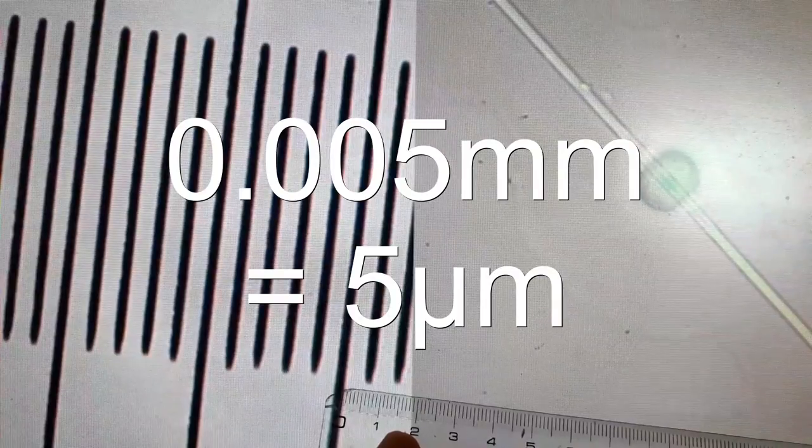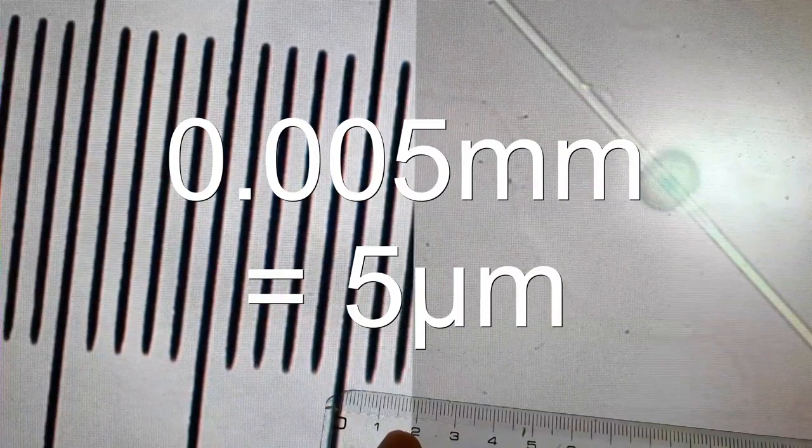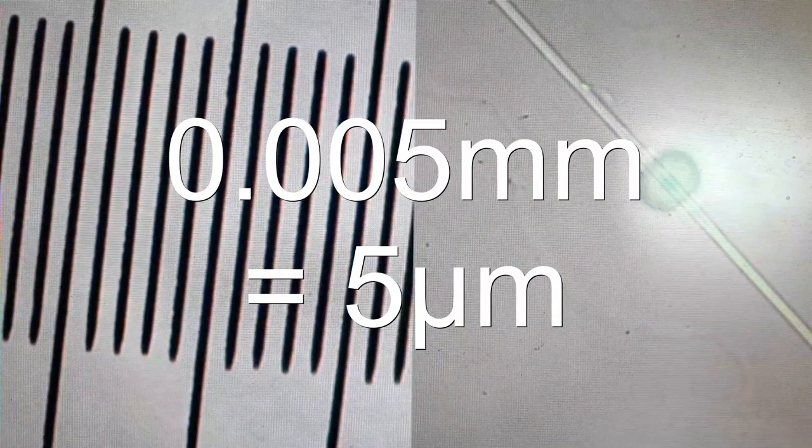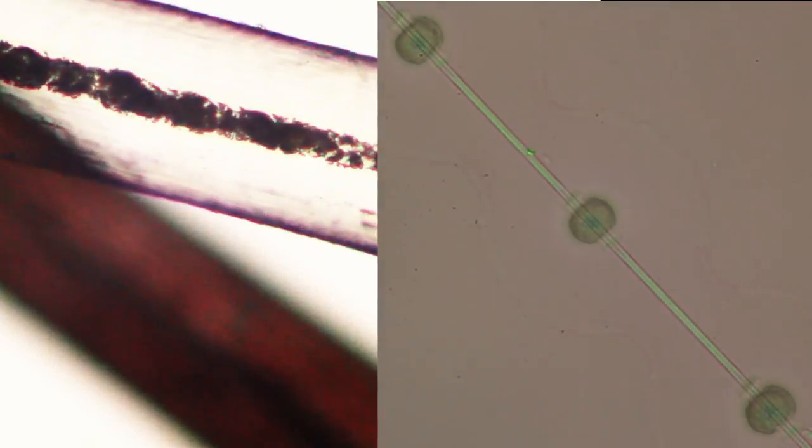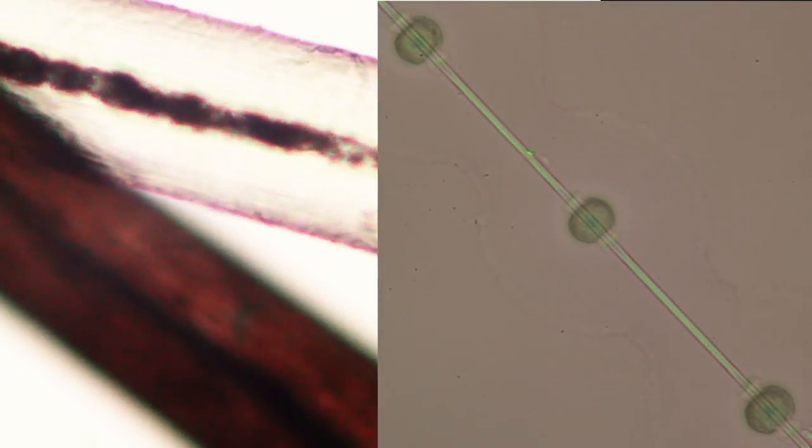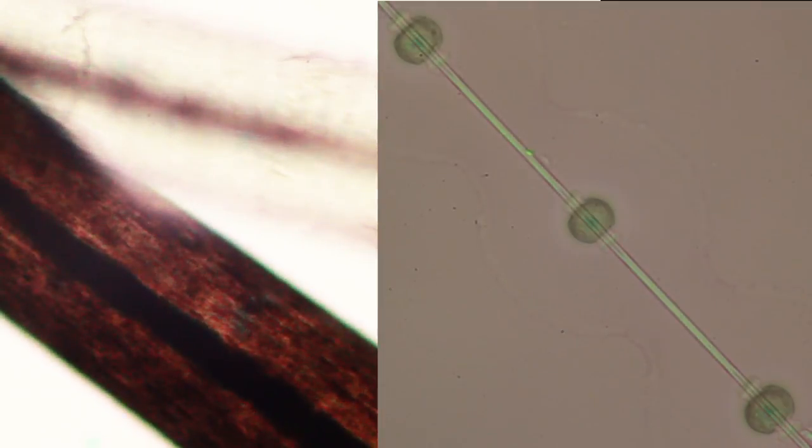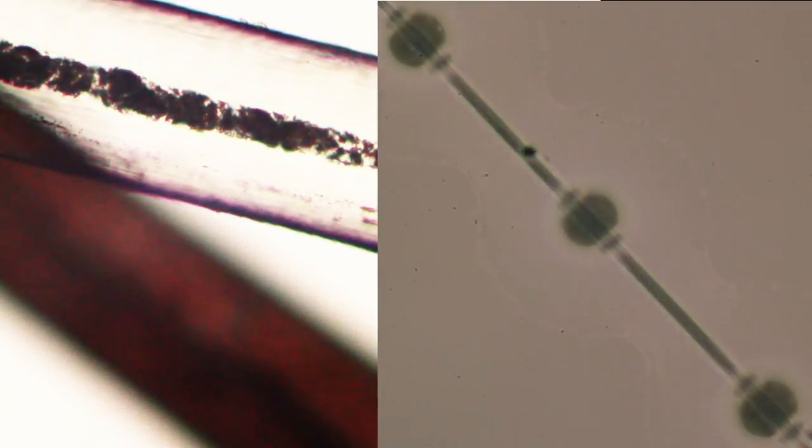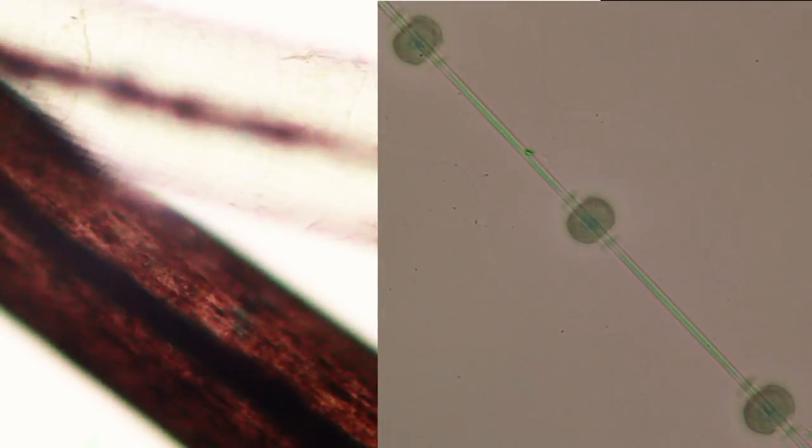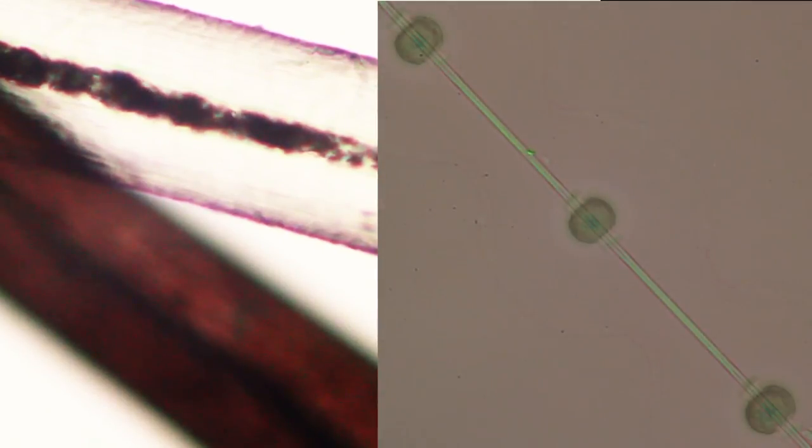This means around five micrometers across. This is about half of the diameter of a cell. It's kind of difficult to imagine this small size, so on the left side I now included my hair - I have black hair and also white hair, I'm already getting a little bit older - and on the right side I have the thread of the spider's web. You can actually see the difference in thickness is quite remarkable, and I think this gives a very good comparison of the different dimensions.